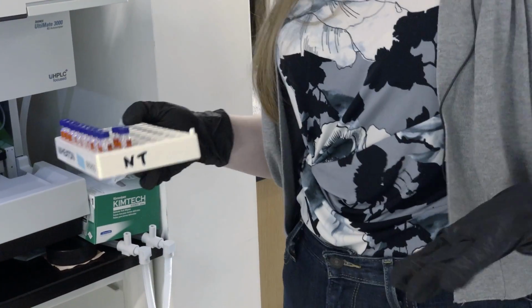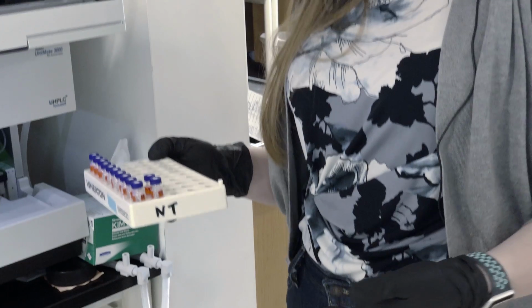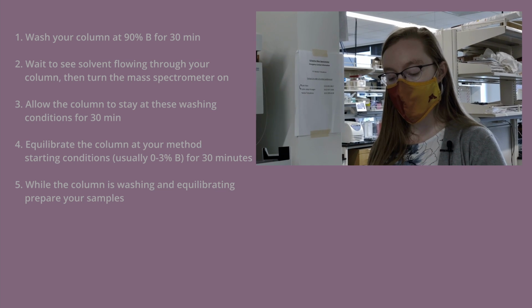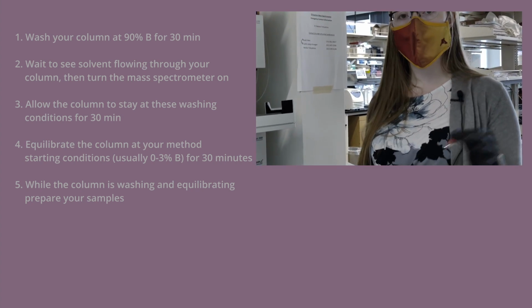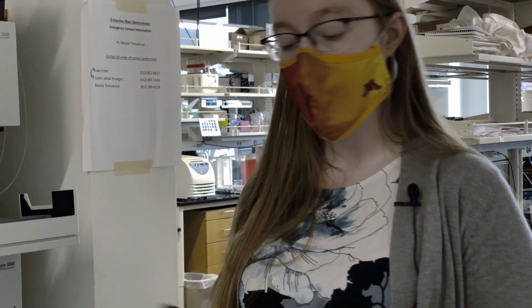Once you've gone through the first 3 steps of making your solvents, setting up and purging the instrument, and getting your column equilibrated, you'll want to get your samples into the autosampler of the instrument. First, to prepare your samples, you will have no doubt gone through the SOP for whatever analyte you're looking for. You'll want to reconstitute your samples in anywhere from 5 to 30 microliters of the buffer A that you're using for your analysis that you took out at the beginning of the protocol.